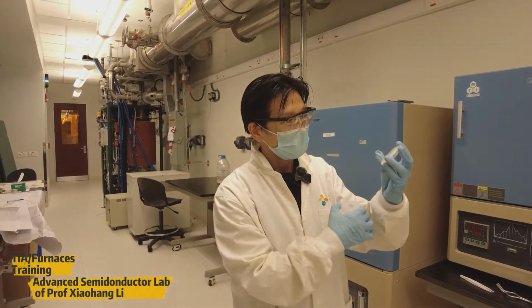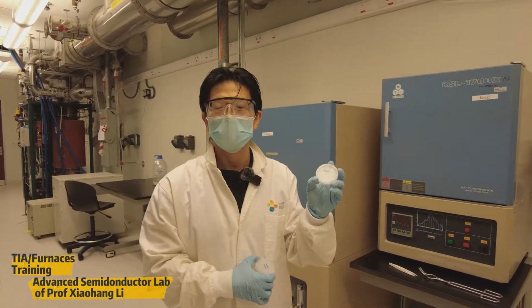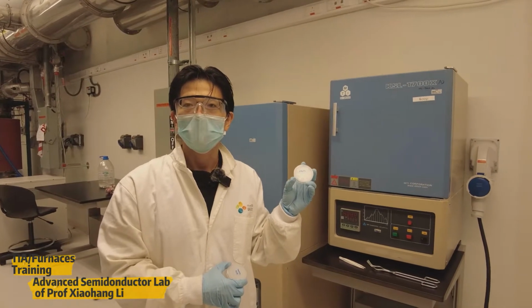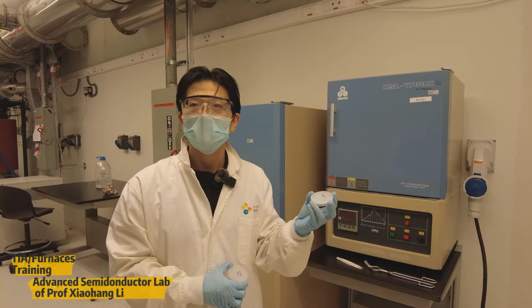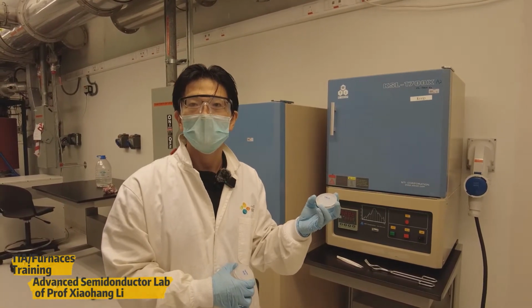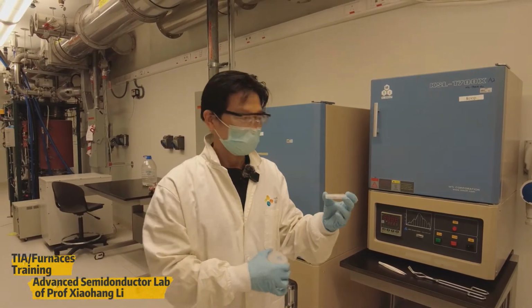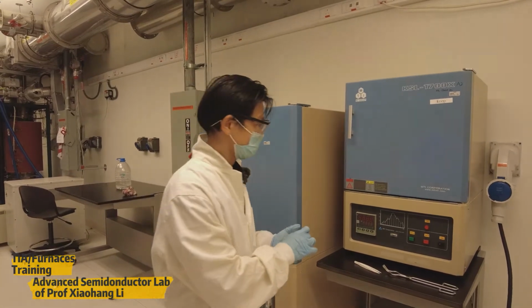We will put these samples in the oven and do the high temperature annealing to do the TIA method. It will make the gallium and the aluminum atoms interdiffuse to each other, and we can have the aluminum gallium oxide. Open the chamber, put the sample, and start the process.